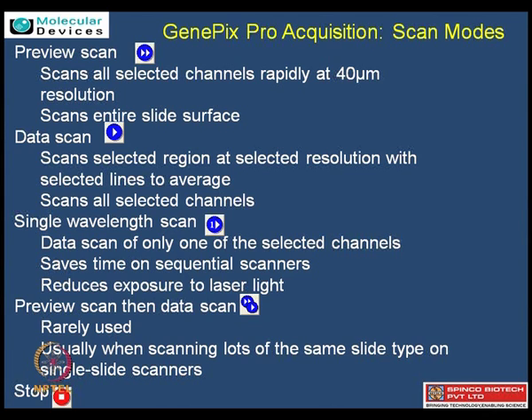So it's like any general scanning, even if you want to just scan a sheet, right? First of all, you'd like to preview it, just to get a glimpse of the process, like how the overall image looks. And then since you know your experiment, you know your requirements, like what wavelength needs to be used, what type of fluorophore you have used, then one needs to optimize and correct those things during the data scan, which is the actual scan performed. And then after that one needs to review that whole thing and see how the slide looks. True.